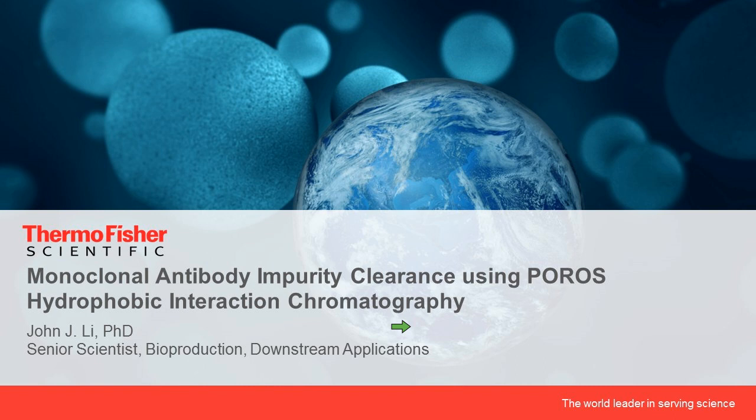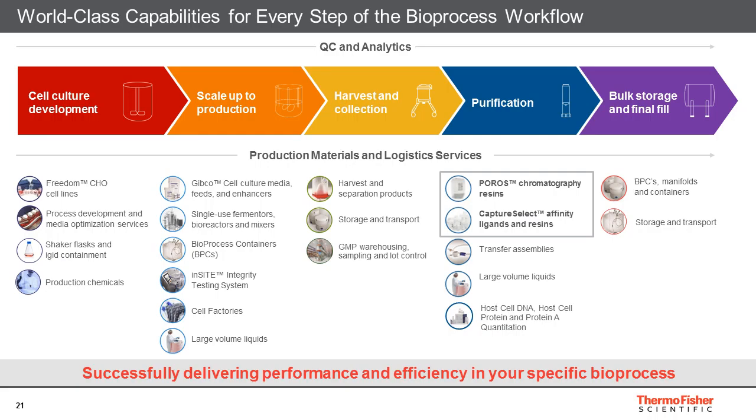Okay, thank you, David. So as David mentioned, now I'd like to turn your attention to a couple of mAb polish case studies performed using POROS HIC, and I'll go into some of David's technology using the MockV particles as well. So just a little brief introduction.